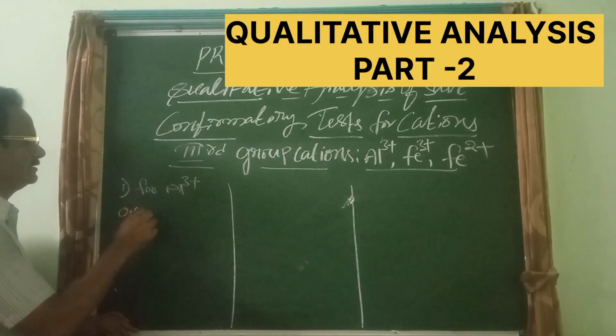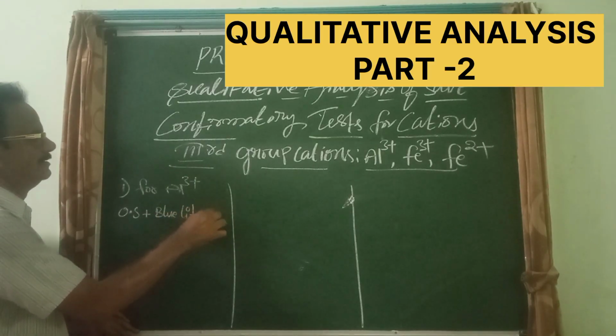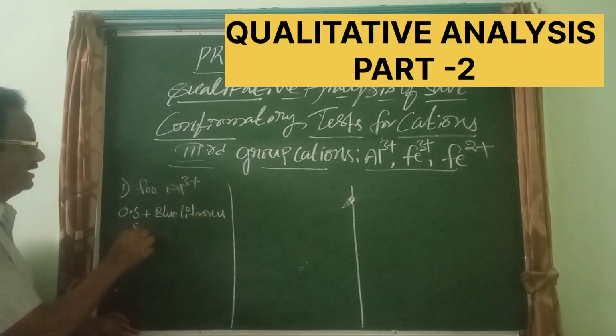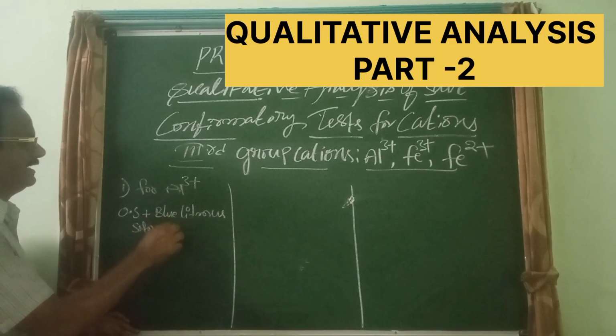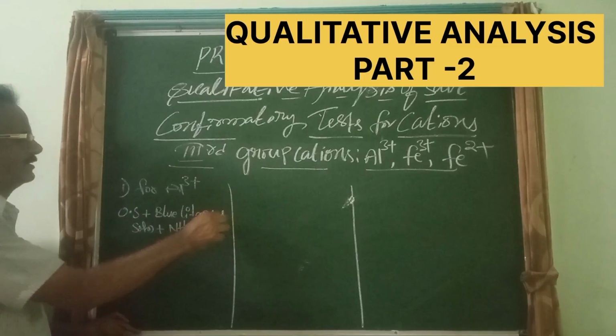Original solution added with blue litmus solution, keep in mind, and added with ammonium hydroxide solution.